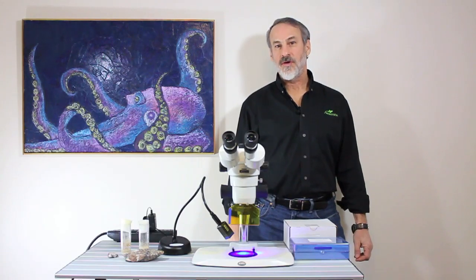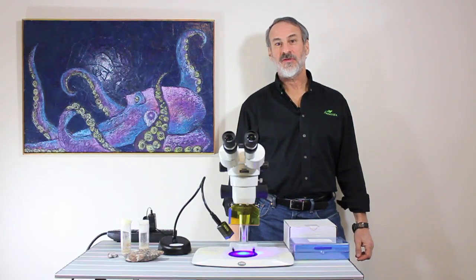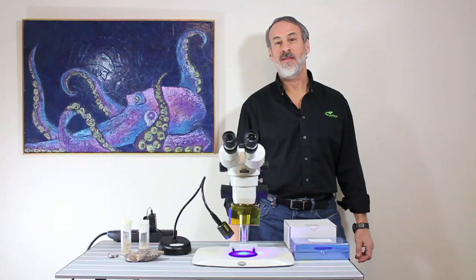So now that you've turned this ordinary stereo microscope into a fluorescent system, what can you do with it? Well, just about anything you want.